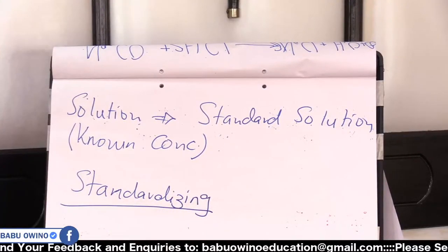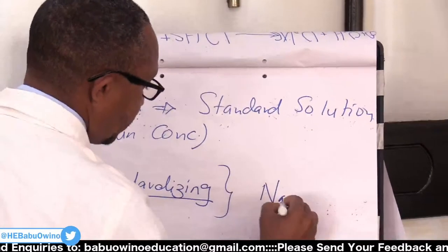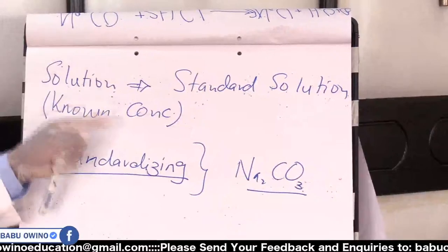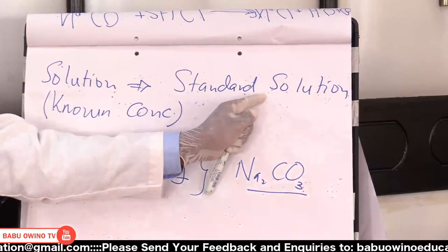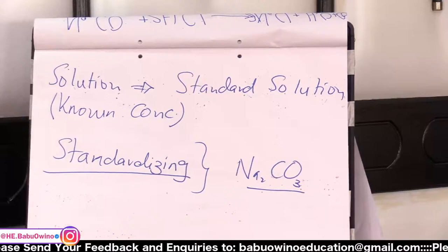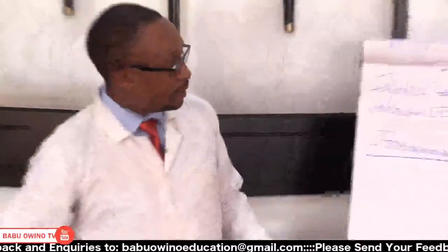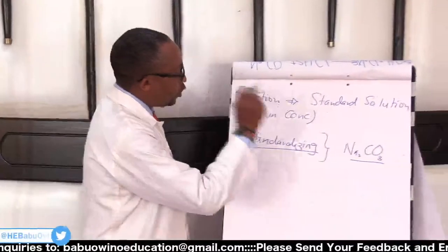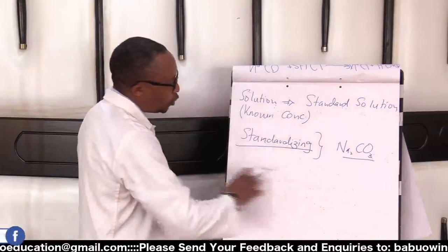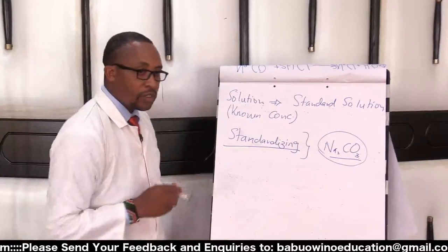So in our case, for the sodium carbonate, we have standardized sodium carbonate. I say that again, class. A solution whose concentration is known is called a standard solution. So the concentration of the acid was given to us, and that made it a standard solution. The solution whose concentration we didn't know was sodium carbonate. We have used the volumes from the titrations to determine the concentration, and therefore we have standardized. That is one question you could be given.